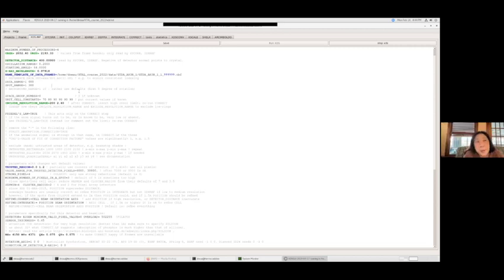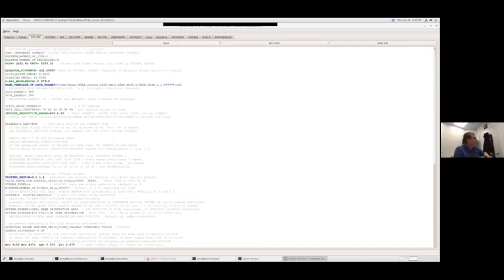David, after you do that, which steps do you run? So after I change the resolution, I'm going to tell it to save. And then up here in jobs, I want to rerun integrate and correct. Those are the only ones that are affected. So in this case, I've already done that because when I first ran it, that integrate step failed. So my job control was actually correct: just integrate and correct. But if I didn't, I would just come up here and adjust that to integrate and correct. The other ones don't need to be rerun.